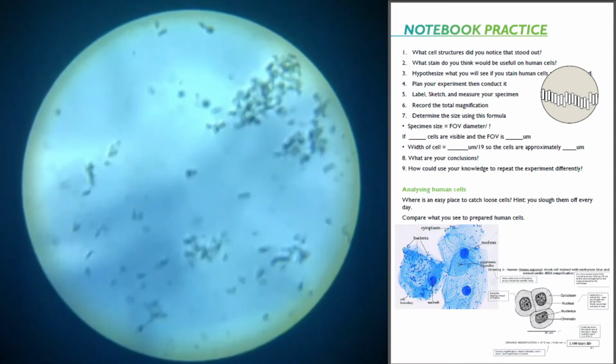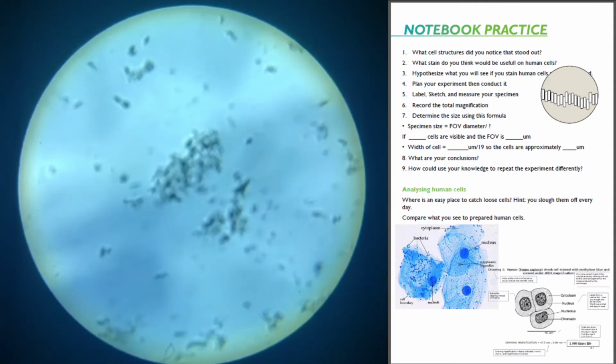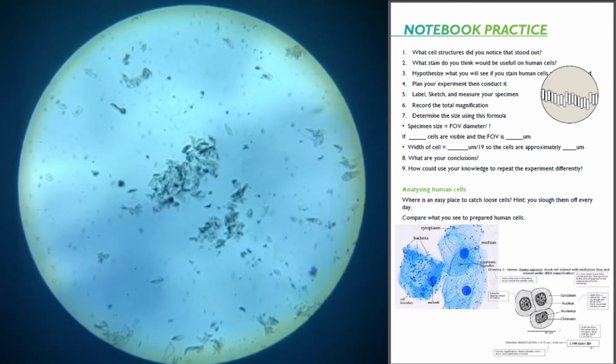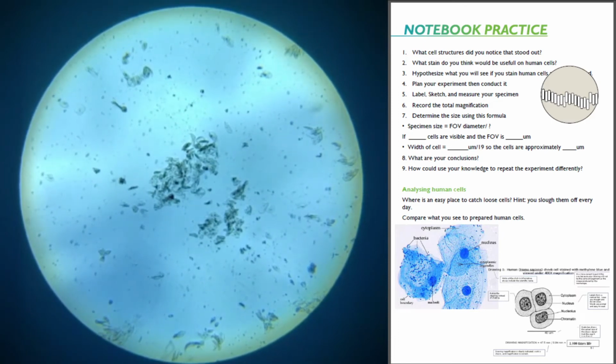Slide it in. Ooh, man. Got a lot of something right there. Nailed it right away. Cheek cells. Do they look just like the picture? Nope, not at all.